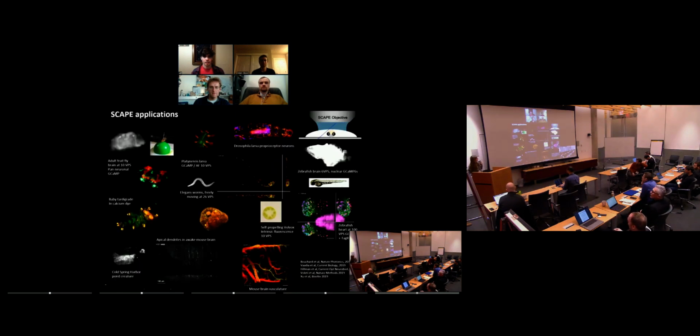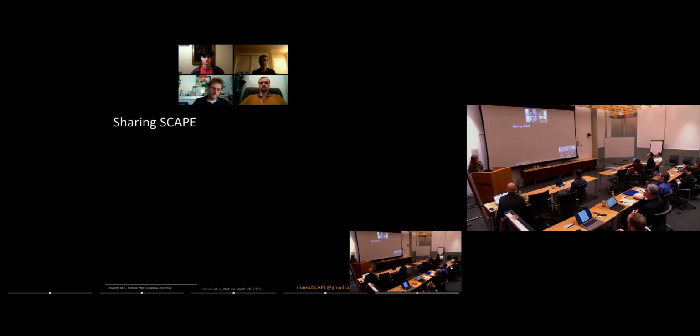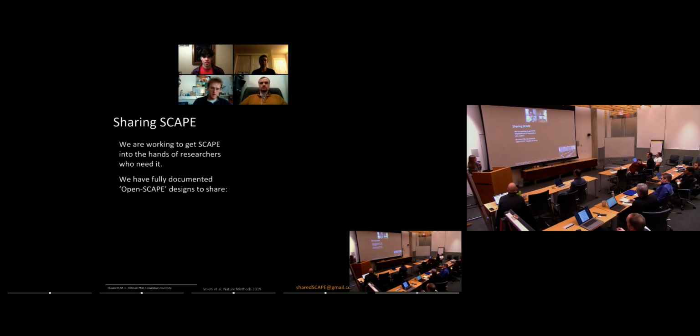So as you know, we developed SCAPE microscopy, which is a method for very high-speed three-dimensional imaging. We've been slogging around for the last six years trying to get people to use it, to try things, to come to our lab, bringing the systems to other places. Over the last few years, we've been working hard to get SCAPE into the hands of people who really need it.